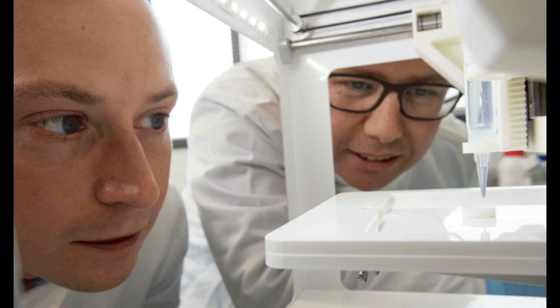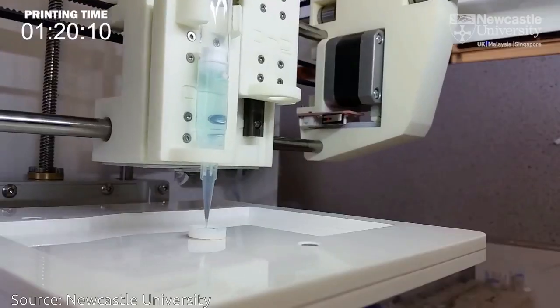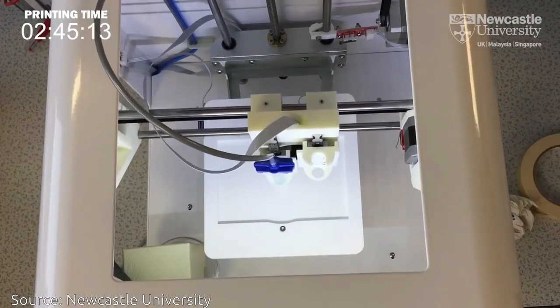Scientists at Newcastle University have 3D printed the world's first human corneas. By creating a special bio-ink using stem cells mixed together with alginate and collagen, they were able to print the cornea using a simple low-cost 3D bioprinter.